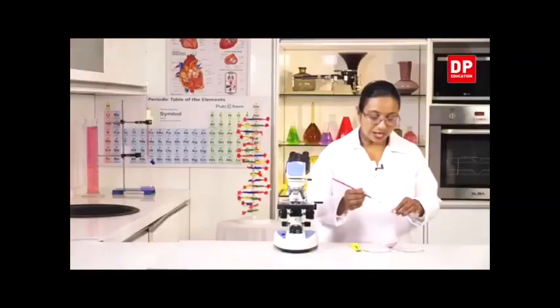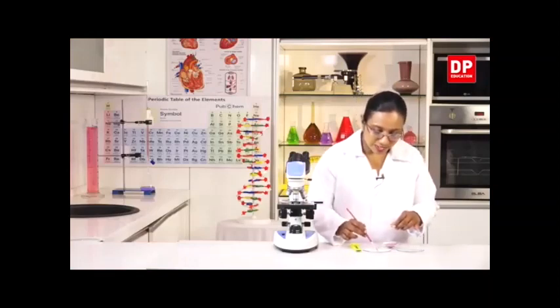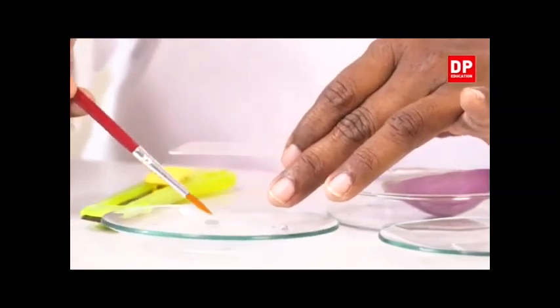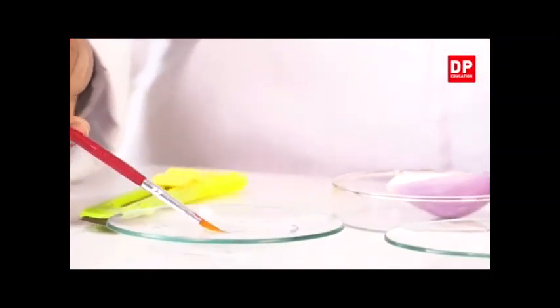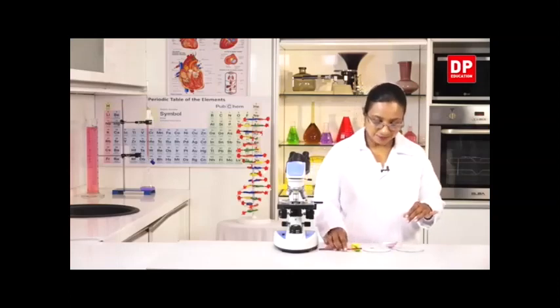First I'll have to put a drop of water on the glass slide, and onto that, using the brush, I will transfer this peel. I will have to take out this peel. Now I will have to transfer the onion peel onto the glass slide. So now I have kept the peel on the glass slide.